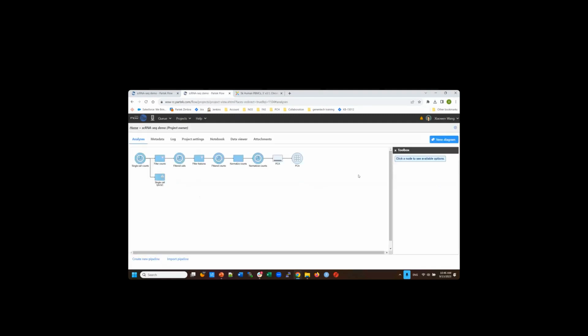So PCA will grab the major components, grab the most informative dimensions, and present them to you. But PCA has some drawbacks here. It's good to look for the bigger difference, but not a smaller difference.